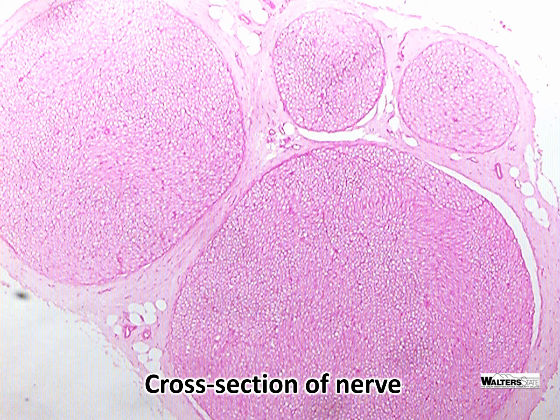The really tiny circles all the way through here are basically axons that are surrounded by a myelin sheath. But you can't really distinguish between those because the magnification isn't high enough. Don't worry, we'll get there. So at this scale, here are the things that I would like you to see.